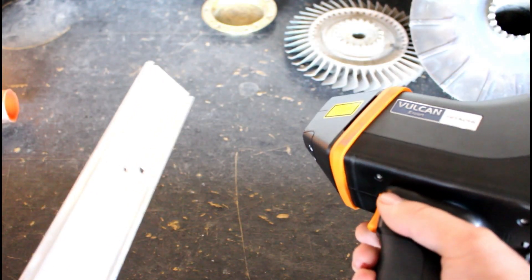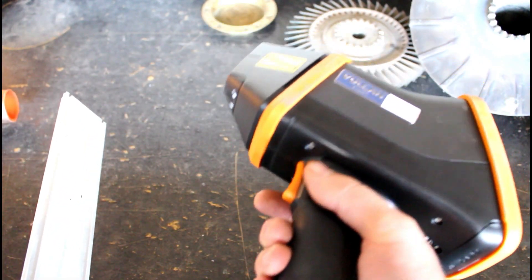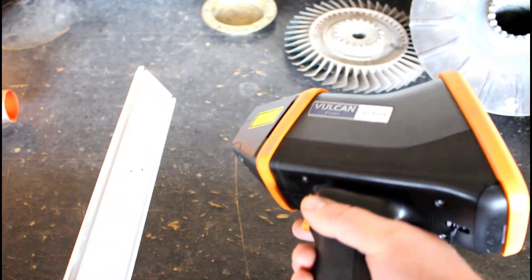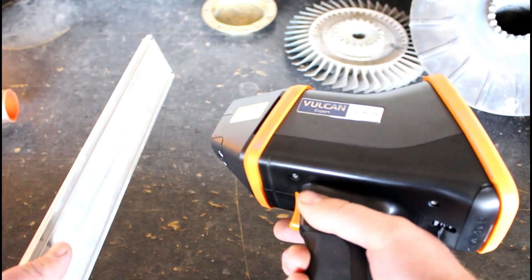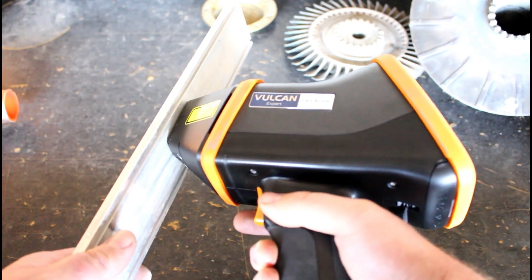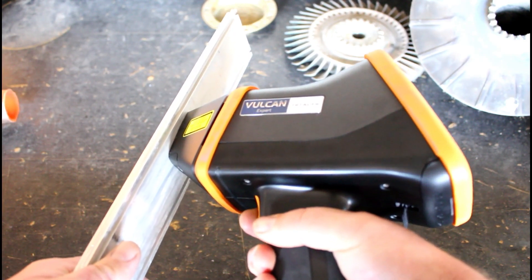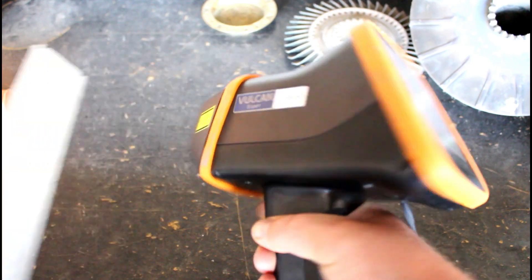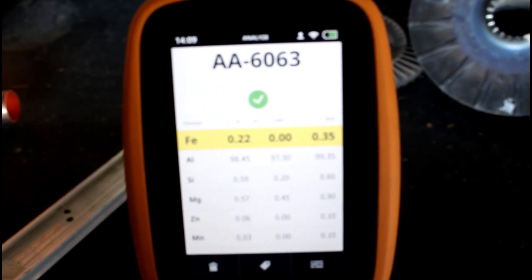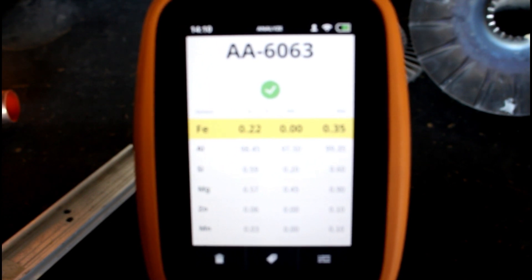All my viewers that know me know that I love the acronym KISS — Keep It Simple, Stupid — and this gun really does that. That's what I like about it. Look how fast it is, and it even lets you know when it's ready to shoot. You hear that noise? That means it's ready to shoot. Watch how fast it is. 6063. There you go. Awesome — for a guy like me who likes to KISS.